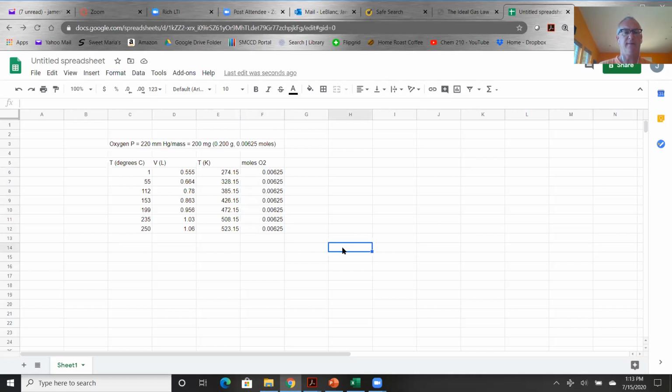What else do I need? Pressure. My pressure, that's right. And what units am I going to have for my pressure? You need atm, right? Atmospheres.